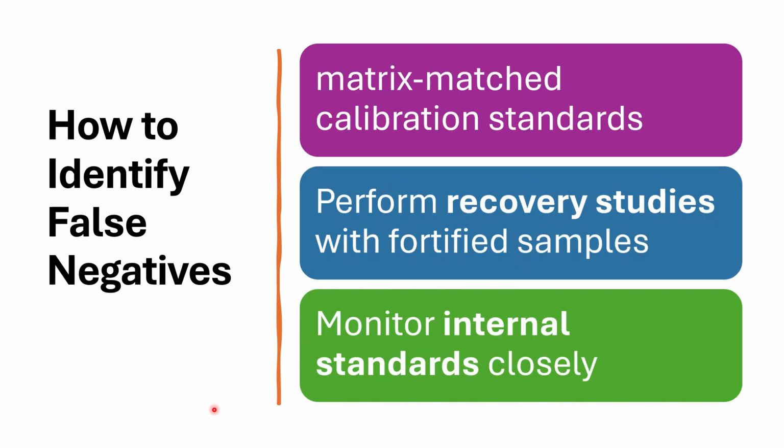Now we have learned the causes. Now let's learn how to identify the false negative. The first one is using matrix-matched calibration standards. Use matrix-matched calibration standards to verify that your method is actually capable of detecting the analyte in real-world matrices, not just in clean solvent.